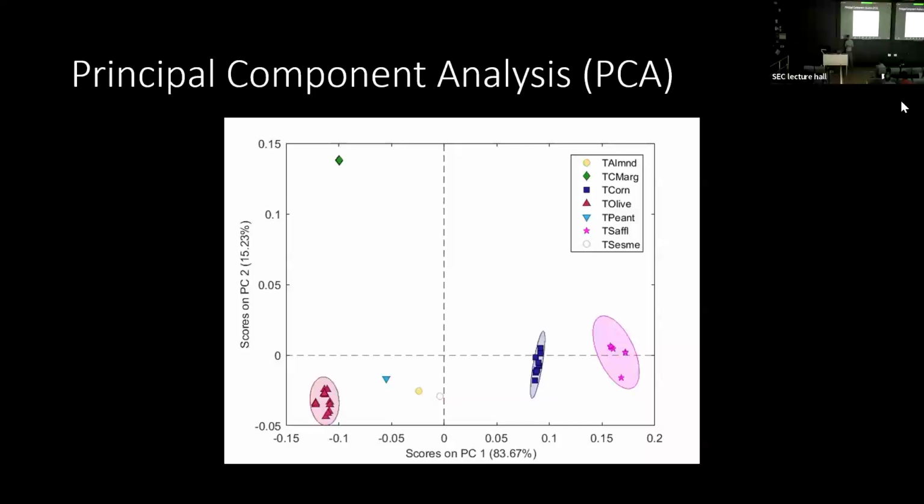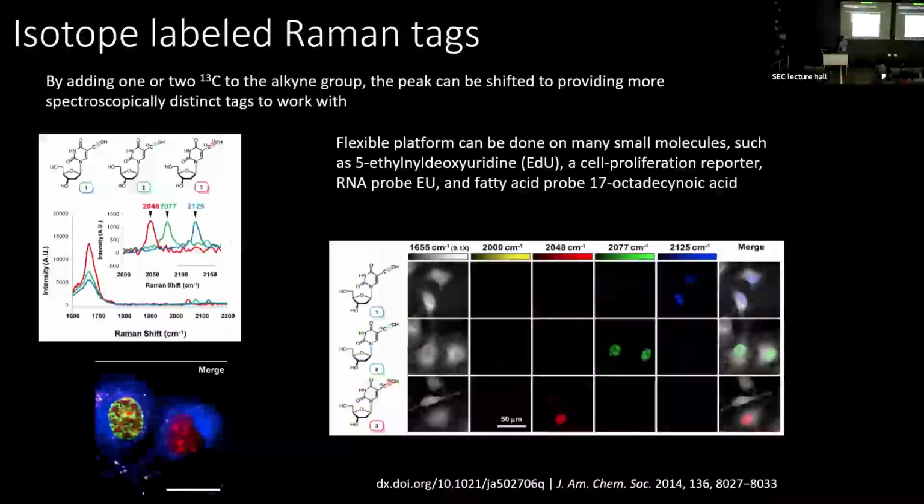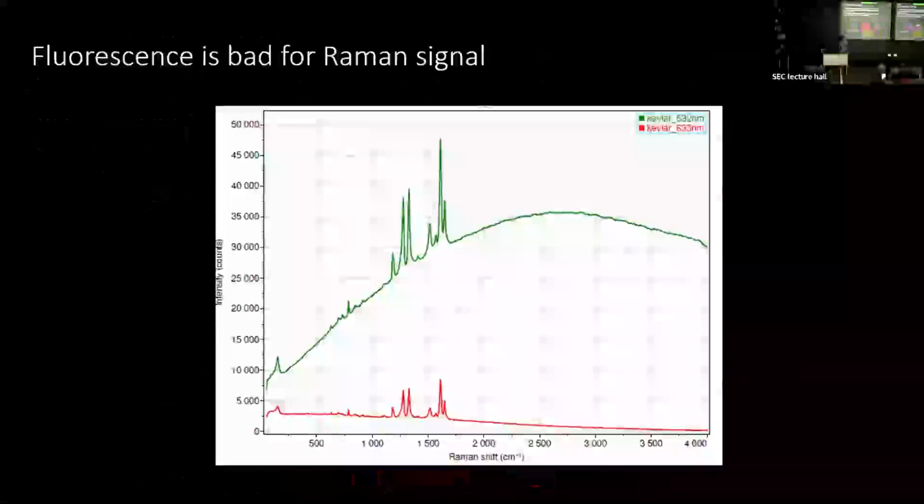So if you have a sample that's fluorescent and you're exciting it with something that would correspond to that electronic transition, you can get this resonance Raman state, which will make certain peaks much stronger than other peaks. If I go back to my Kevlar, where did my Kevlar go?